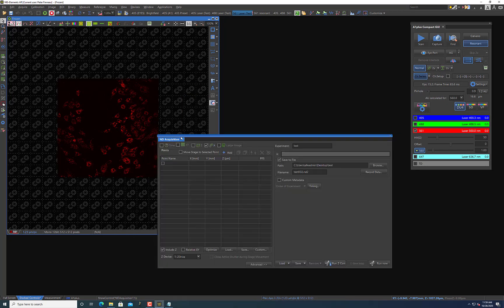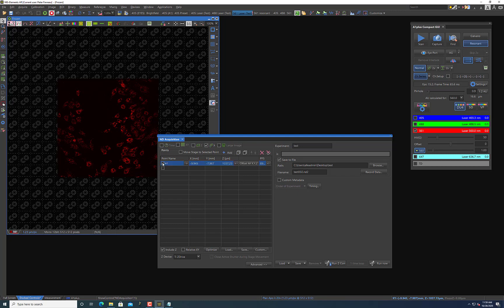And here you can see under XY, this tab up here, you can select many different positions that you want to go into. So let's just say that the one I'm at right now, I want to make that a position that I take an image of. If I want to do that, I can just select this and it will save the X, Y, and Z location. Now you usually will have to select this Include Z box here, so just make sure that's selected so it will save your Z position as well, because otherwise it'll just save your X and Y and it'll likely be out of focus whenever you move back to different positions.